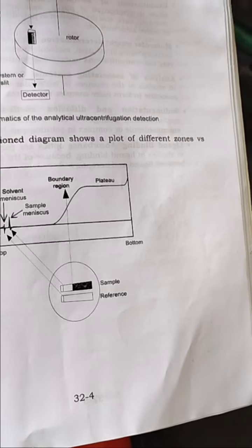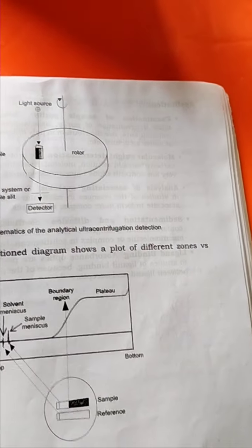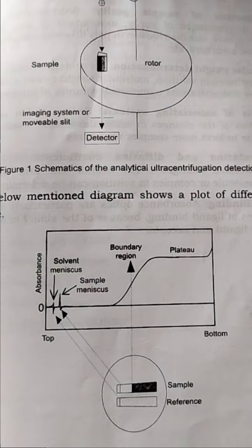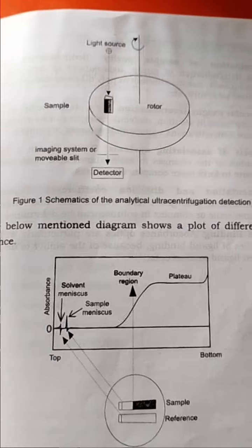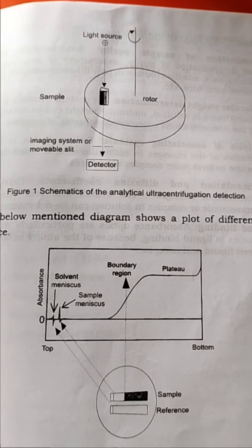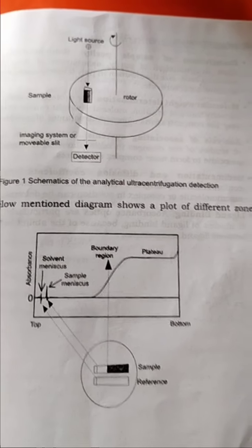The diagram shown has a light source and sample, the rotor which rotates the solution, and a detector which detects the readings.